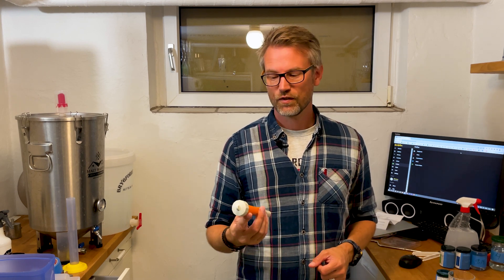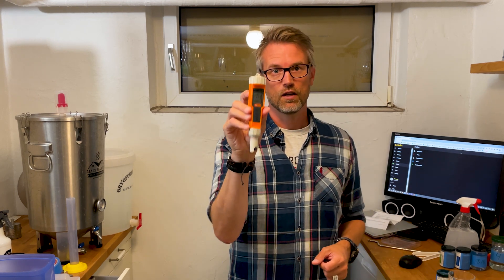Welcome to Beerstars from Beerstar Brewhouse. In this video I'm going to show you how to calibrate a pH meter like this.